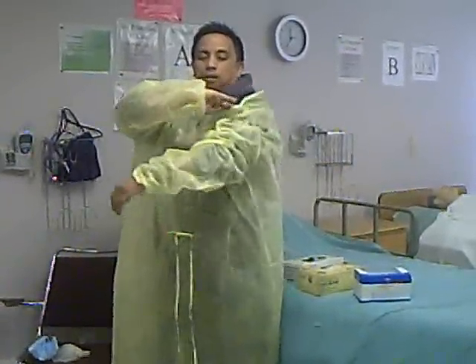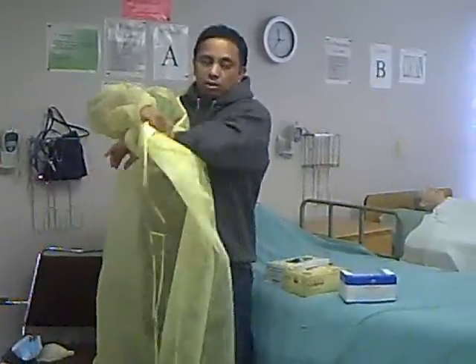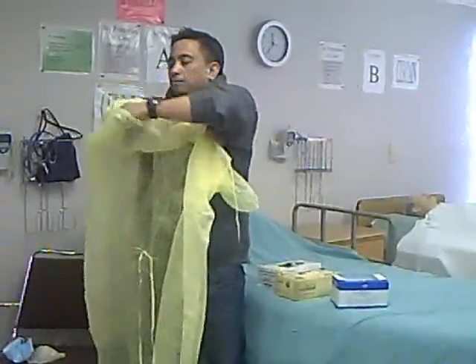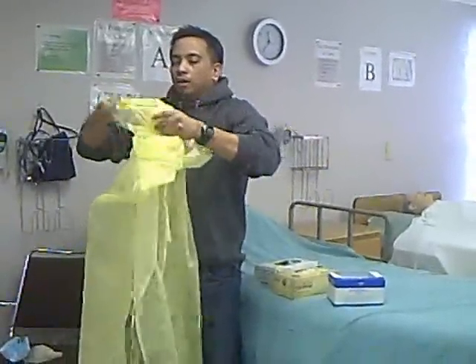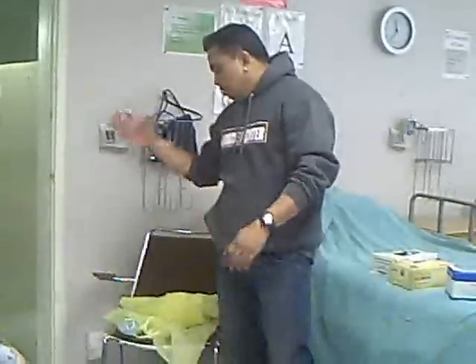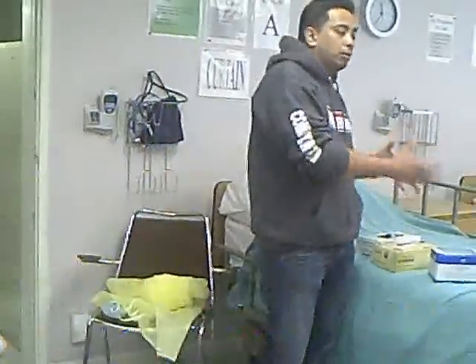Look at my hand — I'm only touching the inside, not the outside. I roll it inside out. Put it in the red bag. That's number three — hand washing.